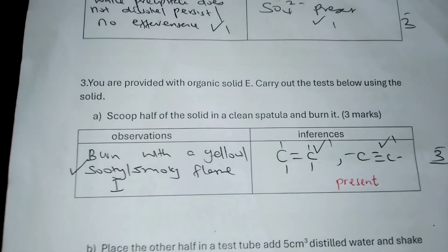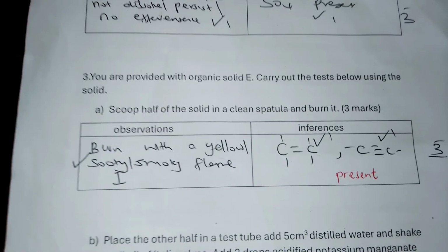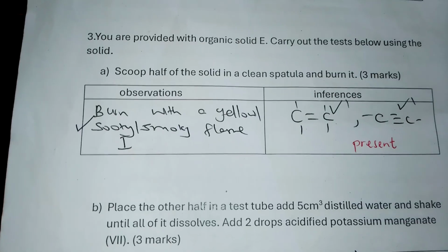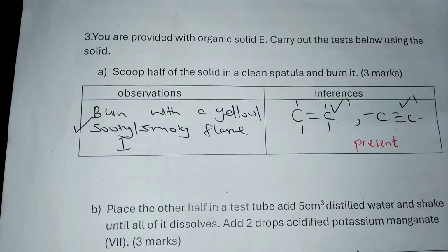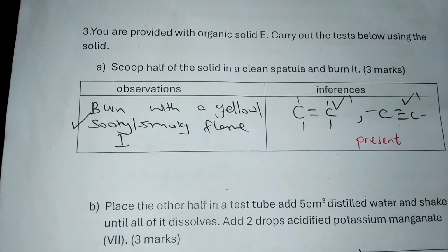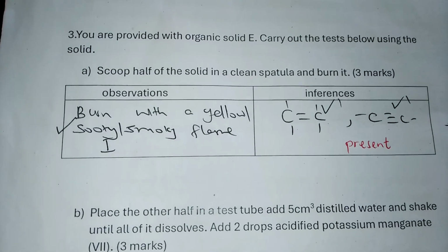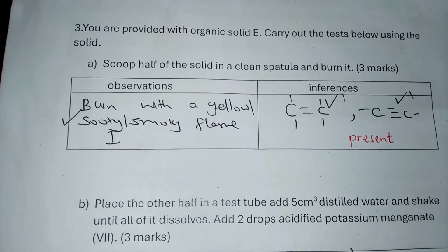Then you are provided with organic solid E, to carry out the tests below using the solid. Scoop half of the solid in a clean spatula and burn it. So we burnt it, and we found that it was burning with a yellow, sooty, smoky flame. So we found that either an alkene or an alkyne is present, because of the double bonds or the triple bonds.